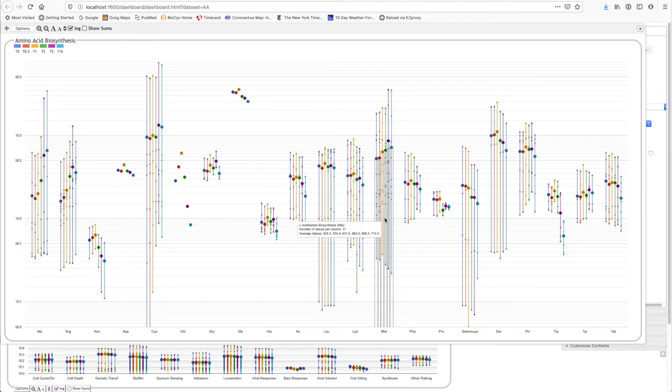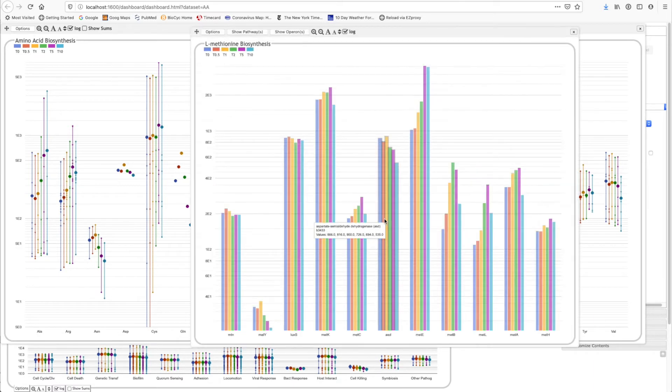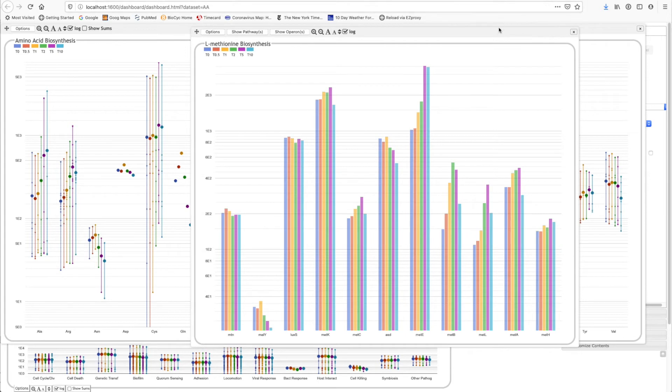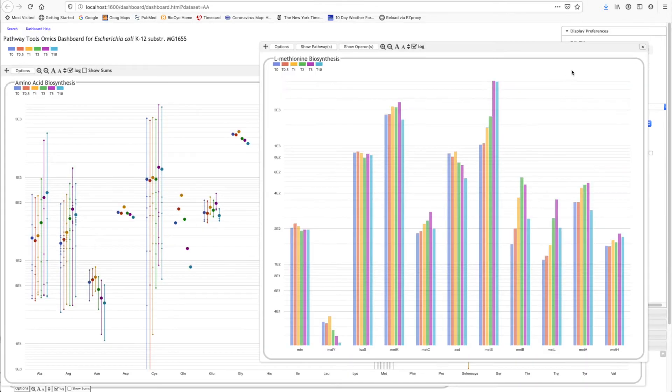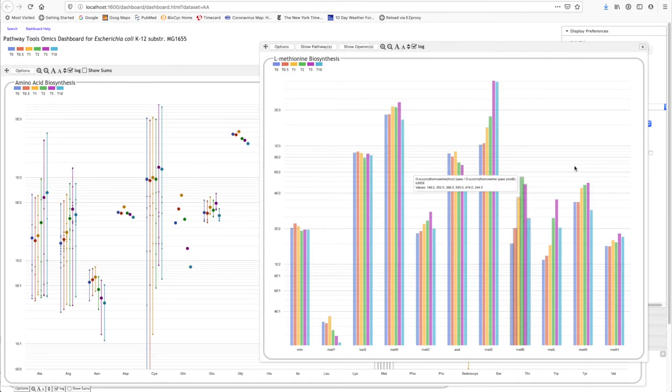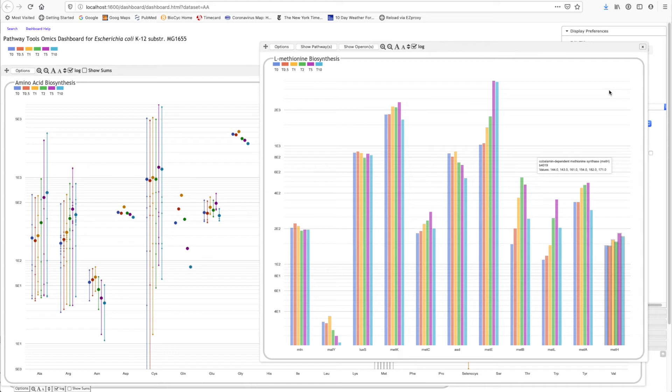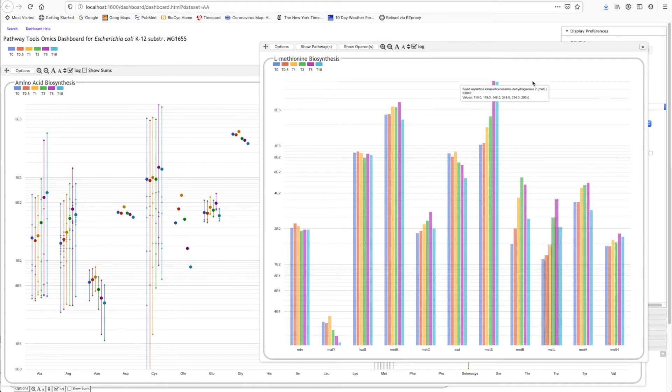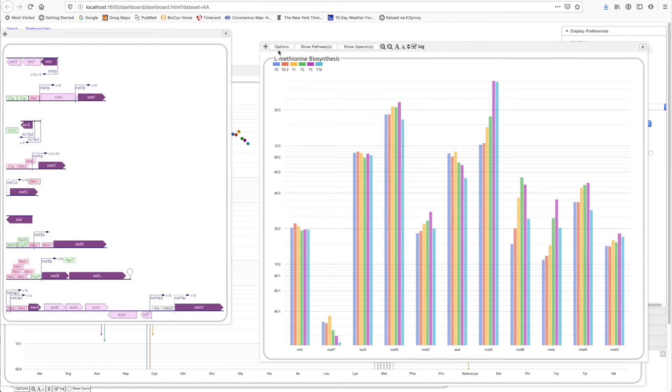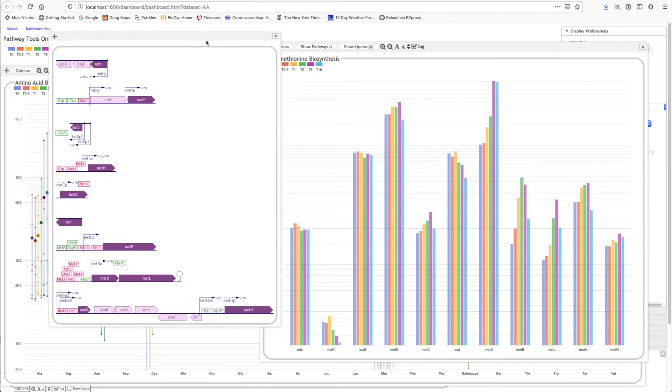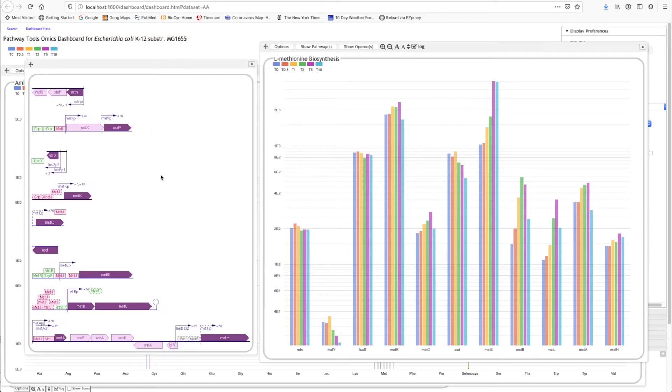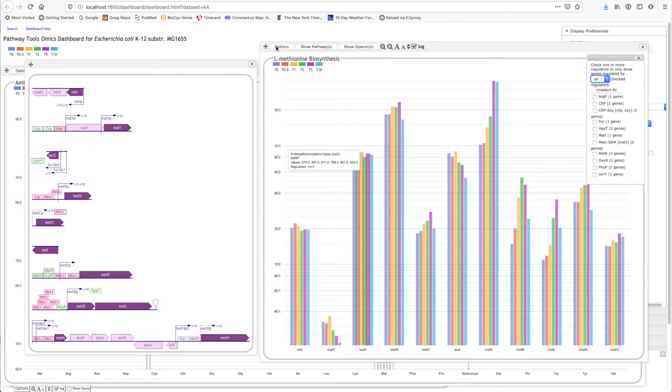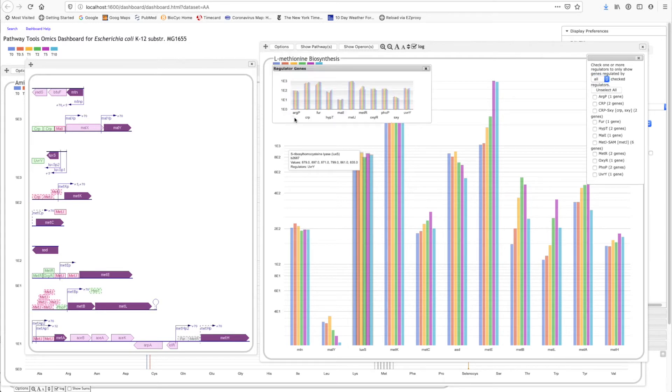If we want to see more detail about methionine biosynthesis, we can click here, and now we see the expression levels of all the genes involved in methionine biosynthesis. We can also see the operon organization of all genes involved in methionine biosynthesis. We can also see the behavior of all the regulators that control the genes in this pathway.